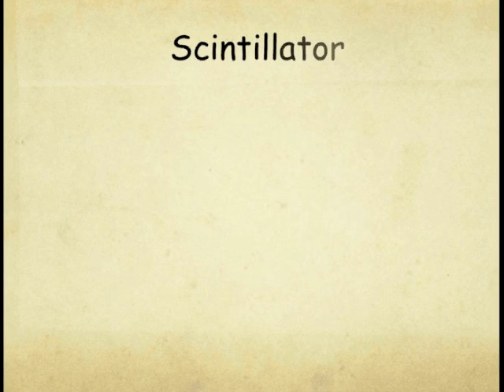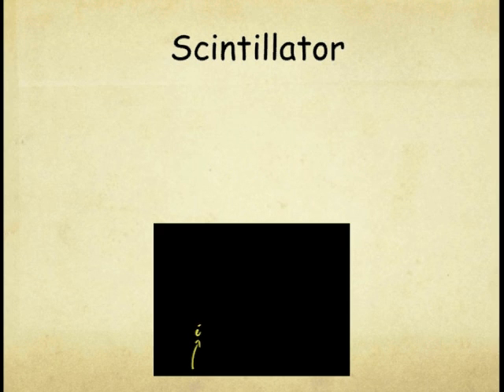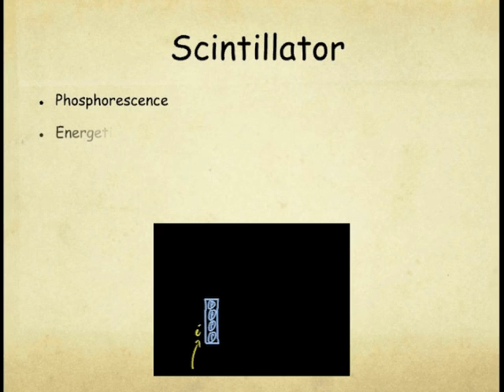When either secondary electrons or backscattered electrons are being emitted from a sample and headed towards a detector, the first thing they will contact is a scintillator. A scintillator is basically a phosphor-coated surface which fluoresces upon excitation. In other words, the phosphor surface, when struck with electrons, produces photons of light.